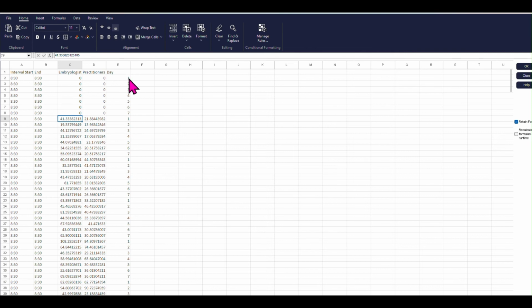So we always start by the first day of the simulation here. So 1, 2, 3, 4, 5, 6, 7, and it goes back again to 1, which is a Monday. So we know the first day is the 3rd of January 2022, and then we can export this spreadsheet to know the utilization rate of staff for each day.